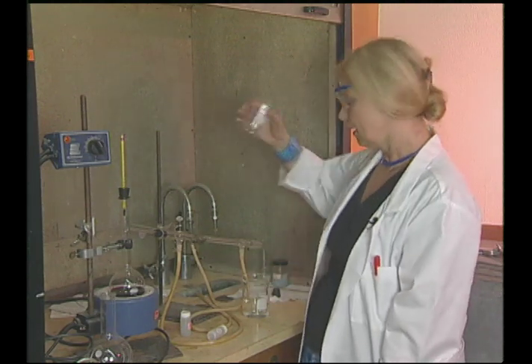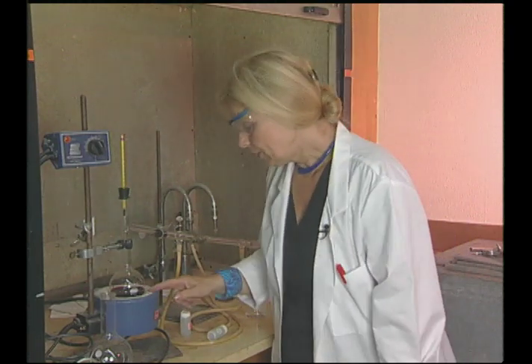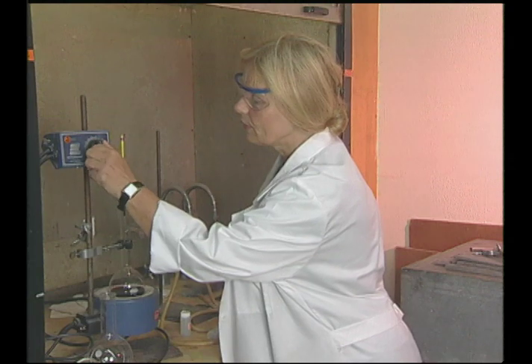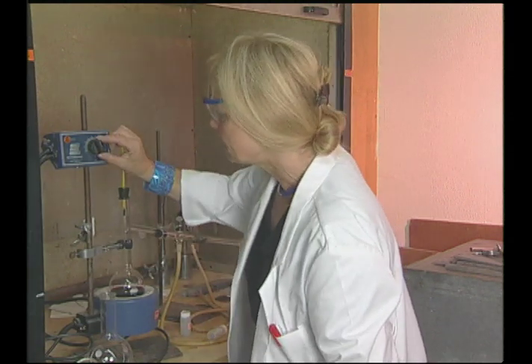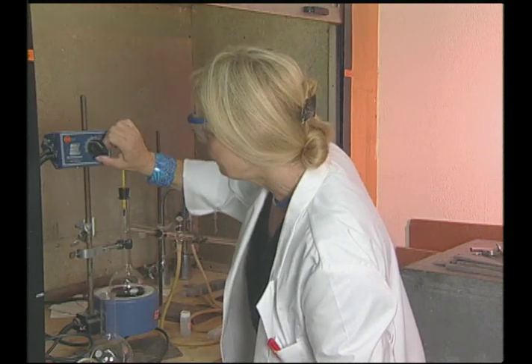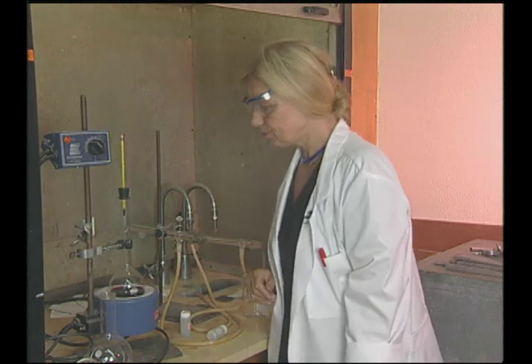Now this is a beaker, so we would call this a receiving beaker. This is our heating mantle, which we can regulate. We can regulate the heat by this control box. And the best thing is not to heat it too abruptly. We can use the margin 3 here.